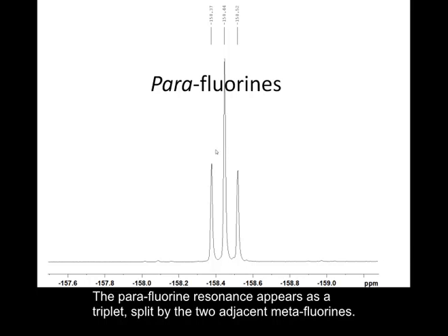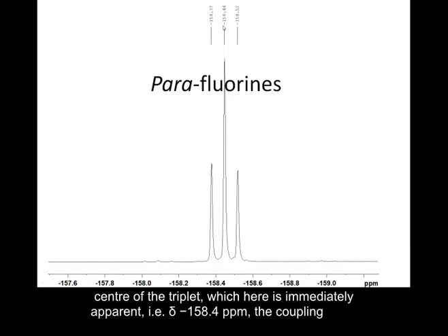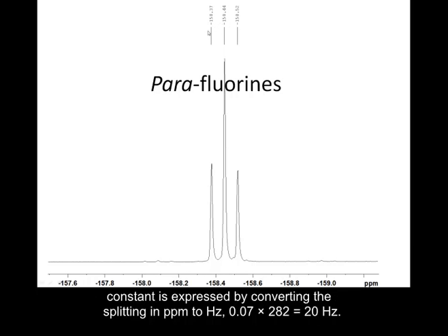If we move on and look at the next resonance, that is the para-fluorine. The para-fluorine appears as a triplet, because it is split by the two equivalent meta-fluorines — the same rule you'd expect in proton NMR spectra. The middle resonance is the chemical shift of this triplet at minus 158.4 ppm. The coupling constant is the separation between two of these peaks multiplied by 282.4, which, to two significant figures, comes out as 20 Hz.